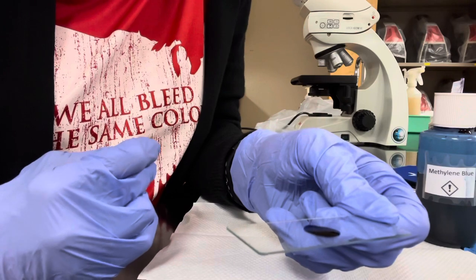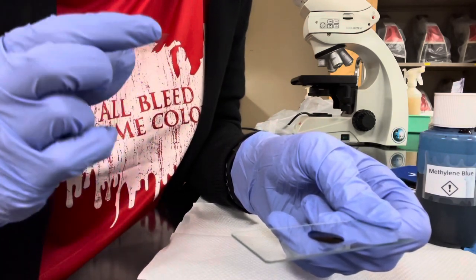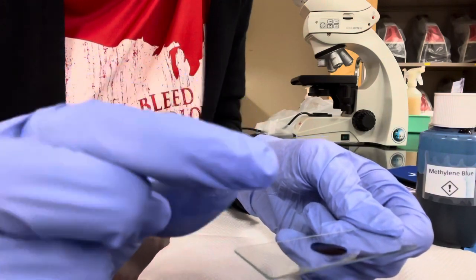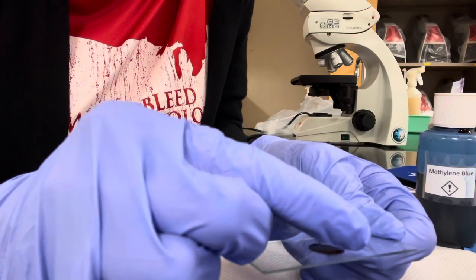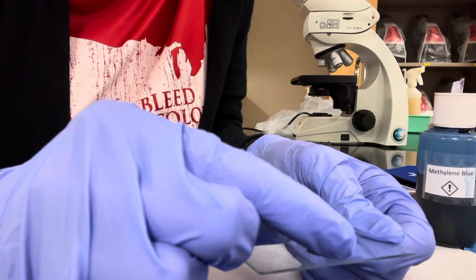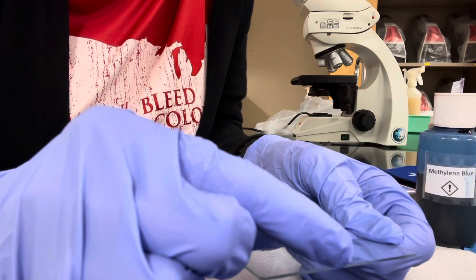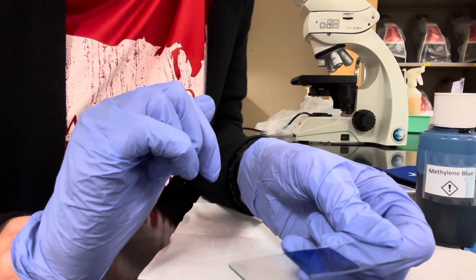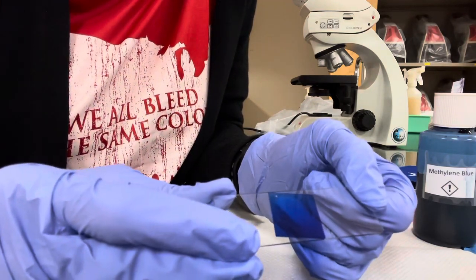The next step is to add the cover slip. To do this without getting air bubbles, you want to take the edge of your slide and bring it to the edge of your specimen, right to the edge of that drop, and then slowly lower the cover slip. And it should look like this when you're done.